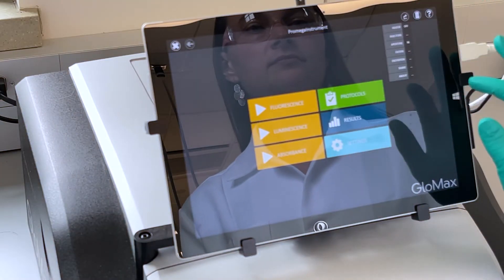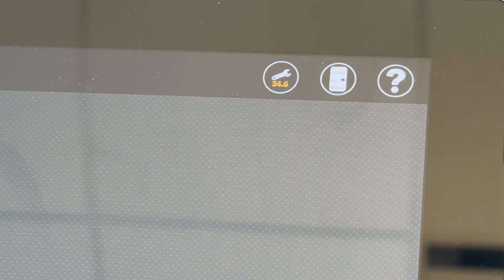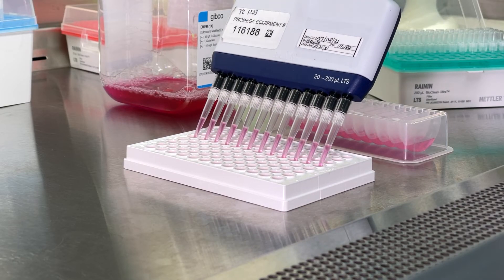First, I select the pre-installed protocol in the simple intuitive Glomax software and pre-warm the instrument to the desired temperature. Then, I set up my plate with cells, reagents, and test compounds.